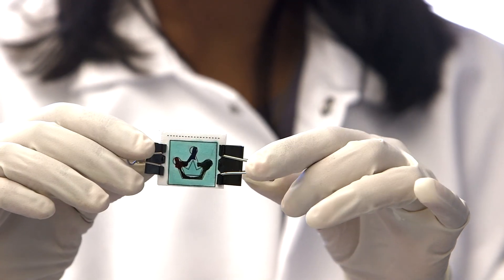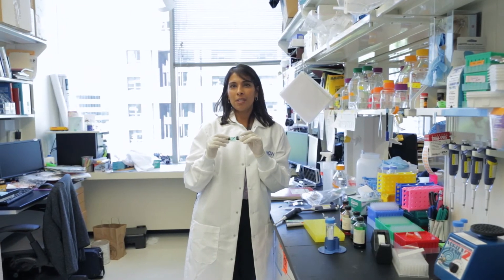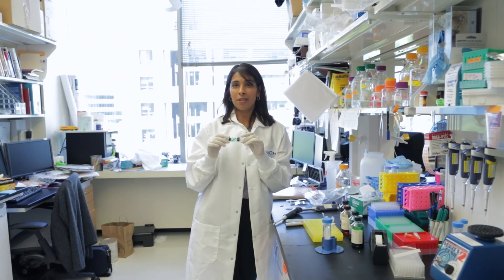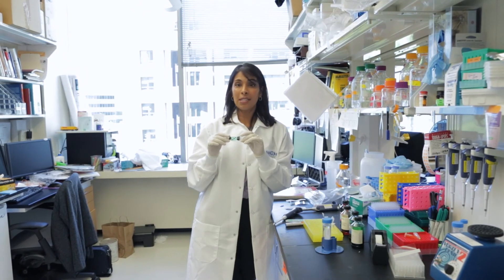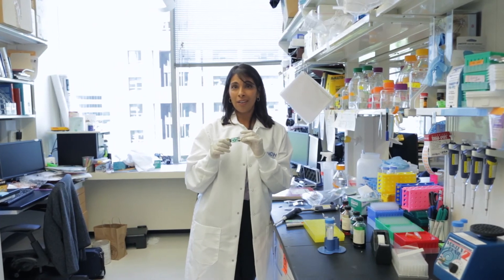Three different colors making a crown in paper microfluidics. In our research, what we like to do is figure out ways to detect multiple different sensors in the urine that give us a reading into disease state. This is called spatial encoding of different analytes — the same kind of thing that we do for a urine sample — a way to get a signal out of three different colors in the sample.